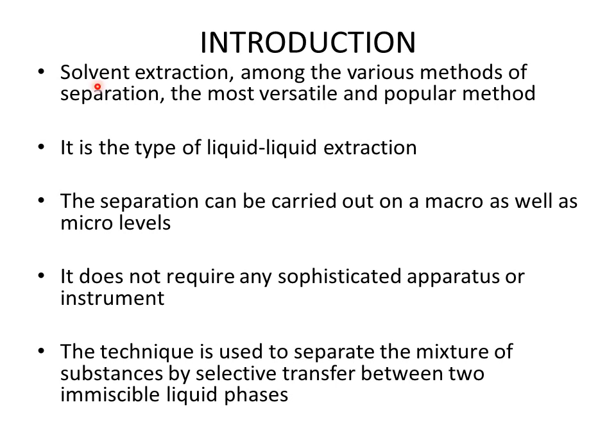So solvent extraction is among the various methods of separation. It is the most versatile and popular method. It is a type of liquid extraction, an extraction method in which the compound of interest is extracted from the solution into another liquid. The separation can be carried out on a macro as well as micro level.